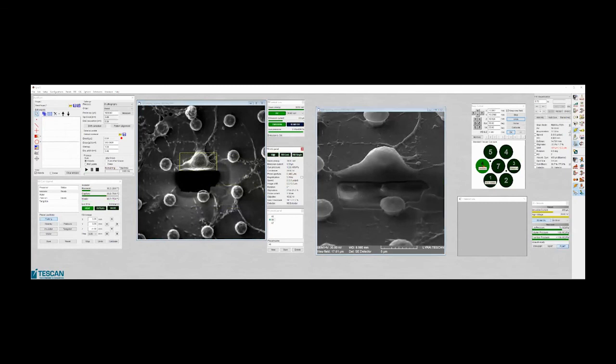And you are moving step by step. You are removing material. You are acquiring pictures, and you will have full information about these neurons. How does it look like? I will just check if this current is enough.